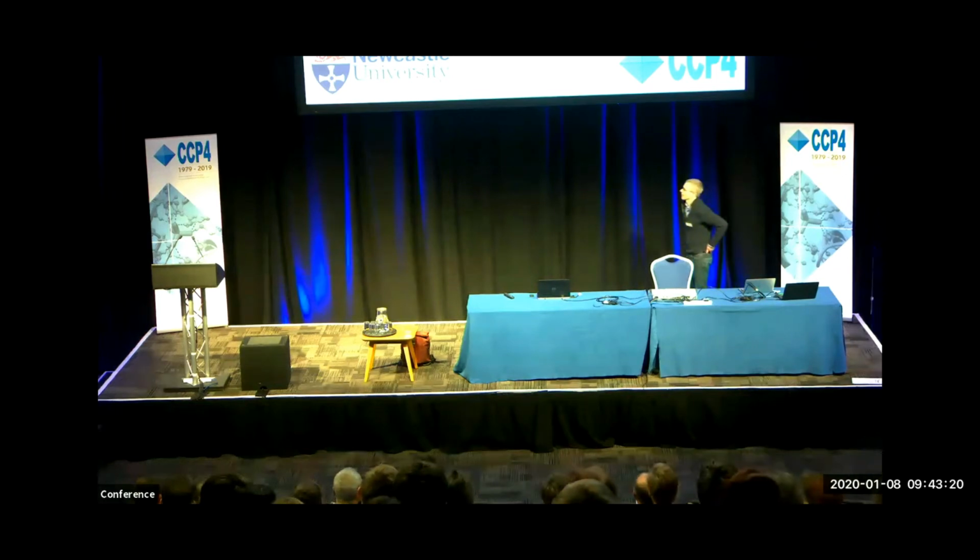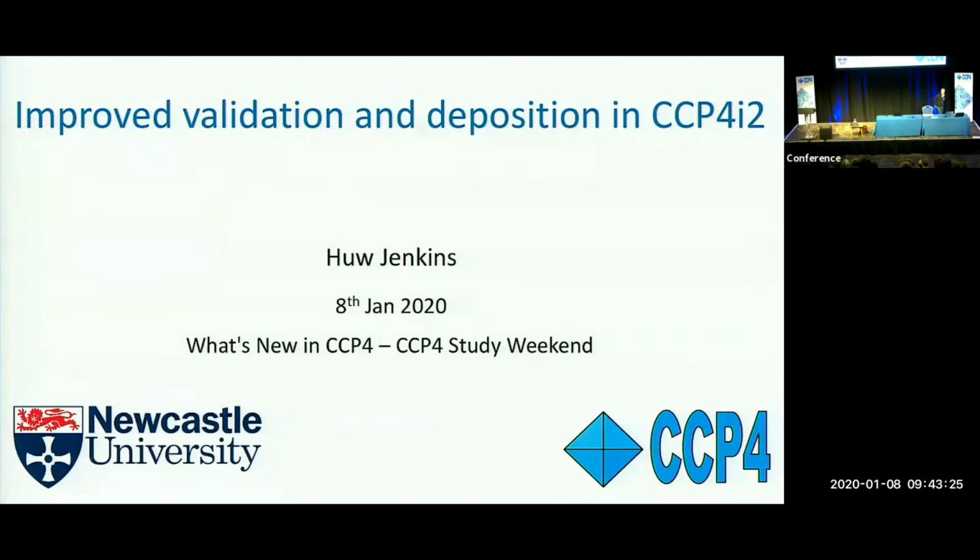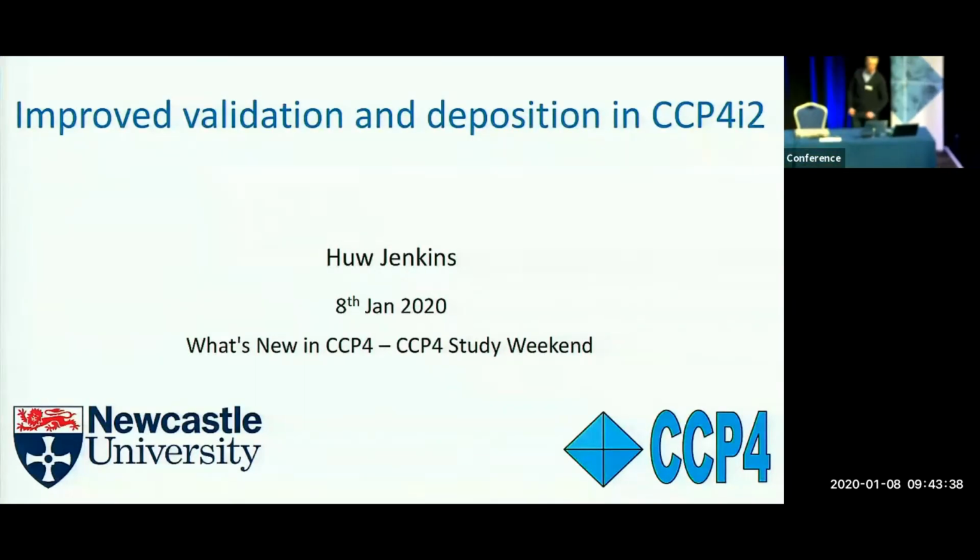Right, I'd like to thank the organisers for asking me to come and talk to you today about new improved validation and deposition tasks that we've just put into CCP4i2 and will be released with CCP4 7.1.